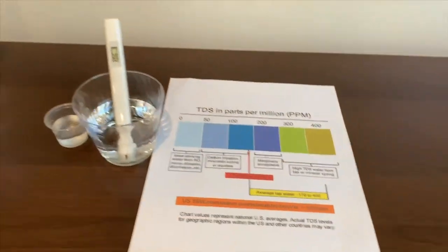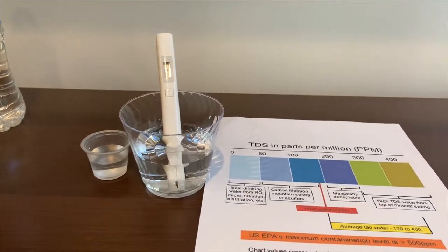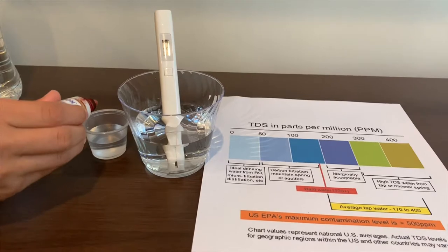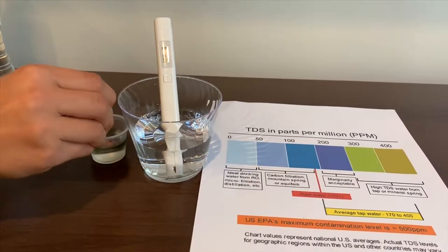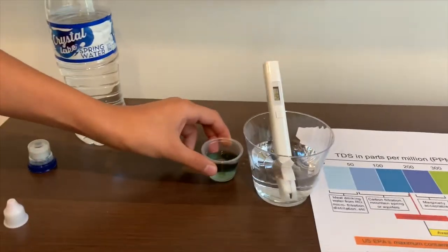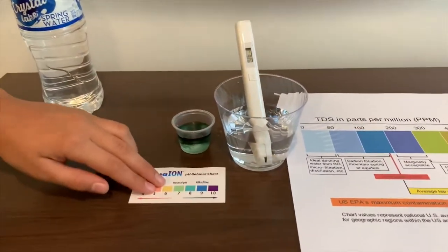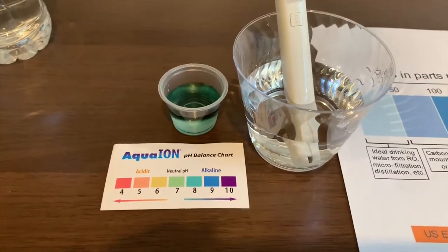Now let's test the pH. Two drops only — one, two. It's really close to seven and eight.